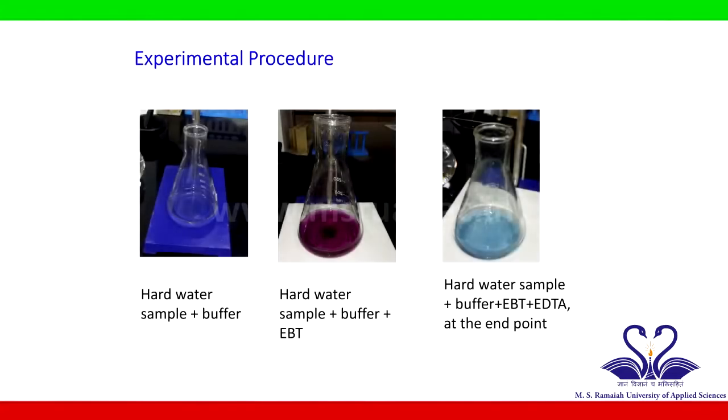Hard water sample plus buffer. Hard water sample plus buffer plus EBT. Hard water sample plus buffer plus EBT plus EDTA at the end point.